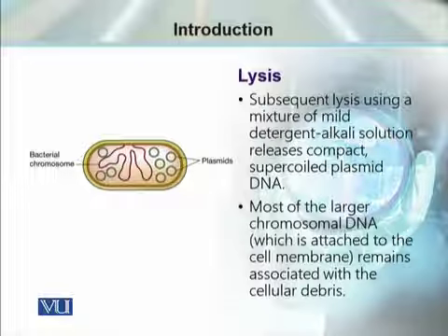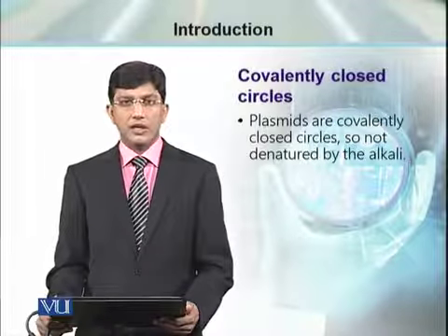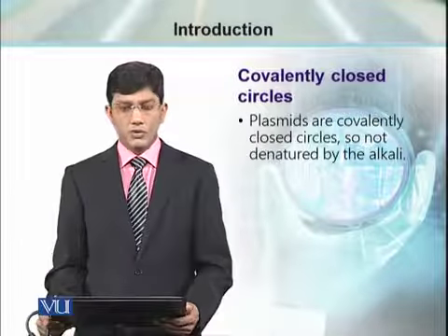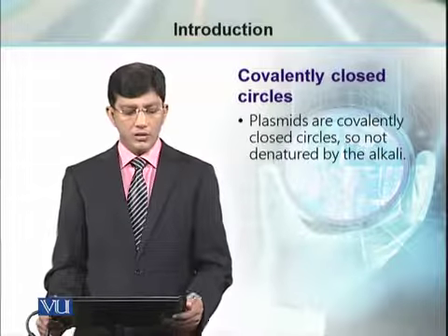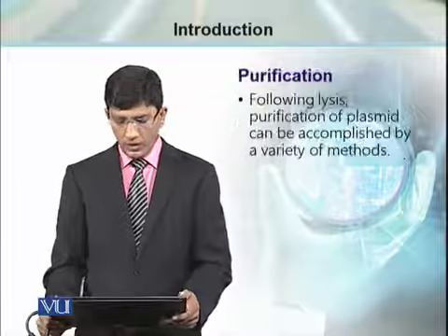Most of the larger DNA, which normally remains bound with the plasma membrane, will be separated as part of the cellular debris. Why is the plasmid DNA not affected by alkaline treatment? This is because the plasmid is a covalently closed circular DNA, and it is not affected by the alkali which is used in the lysis buffer.